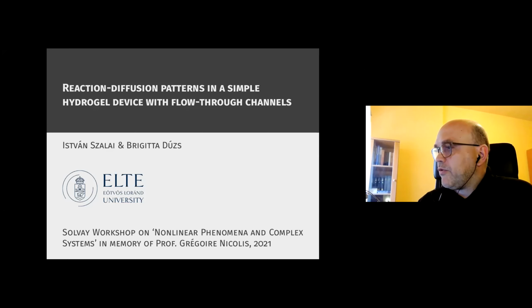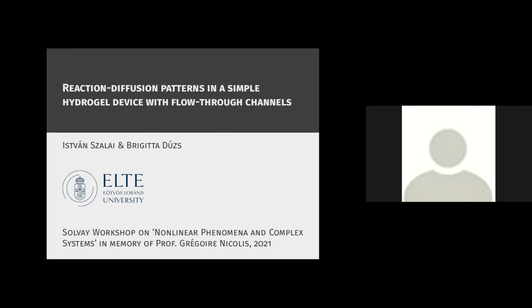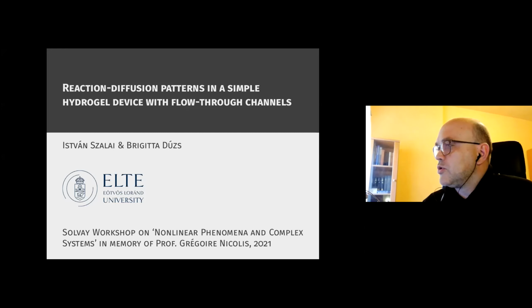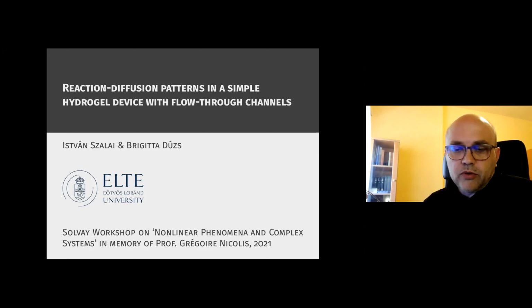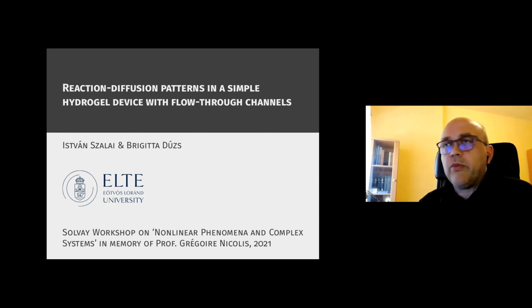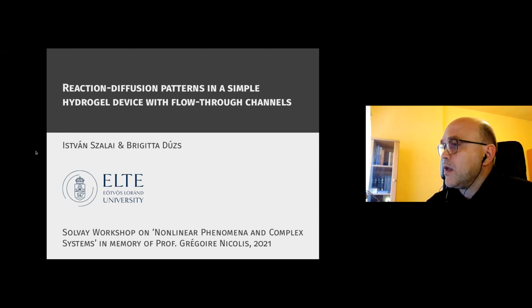Get to the memory of Gregor Nicolis. So what I'm going to show you is just a simple experimental work. Our goal was to create a relatively simple device to study reaction diffusion patterns and phenomena in open chemical systems. A device which is easy to make, flexible, and provides a lot of options for the experimentalist.